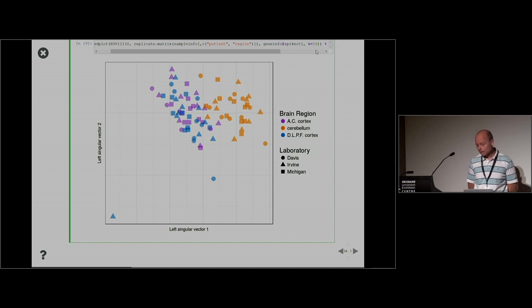That's a really good question. So the question, just to say it back, tell me if I'm saying it right: we're basically learning the nature of the unwanted variation via the replicates and via the negative controls. In particular, the replicates are the replicates across these 3 labs.